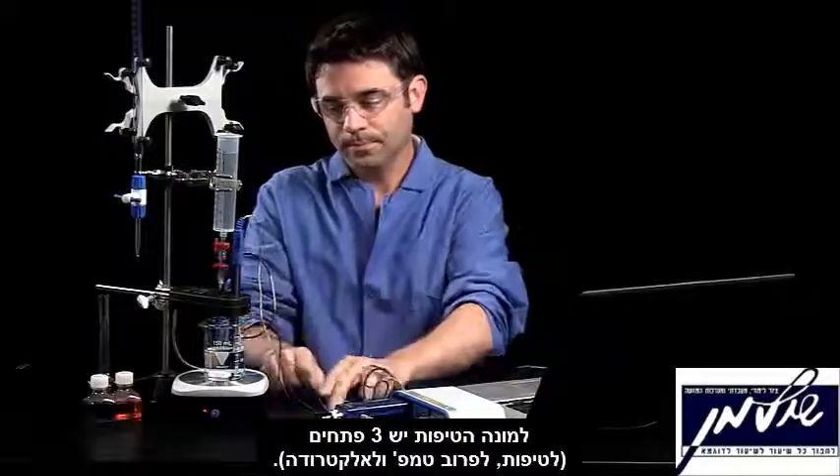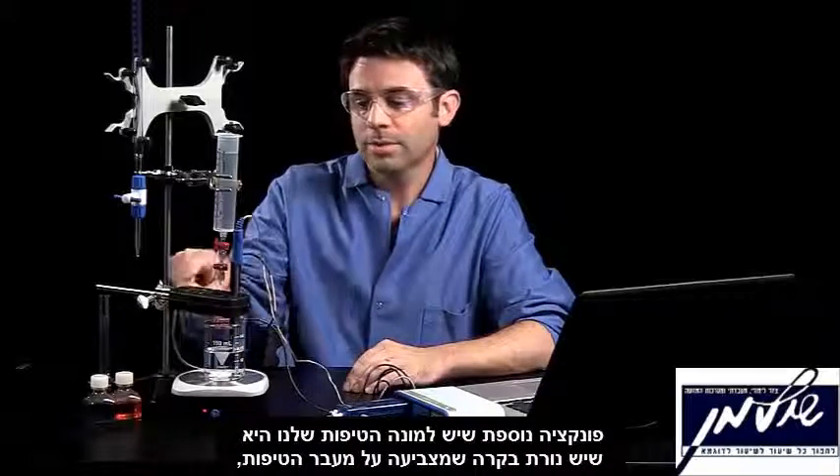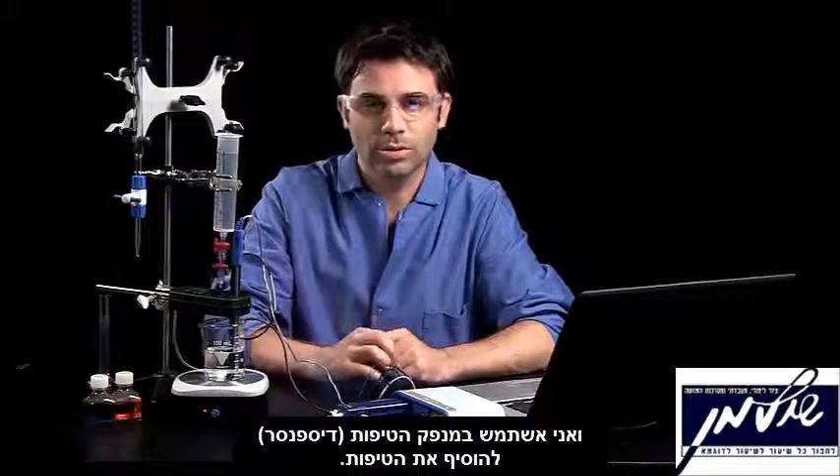There are three ports on here. The other nice thing about the drop counter is it tells me when drops are added, and I'm going to use my drop dispenser to add those drops.